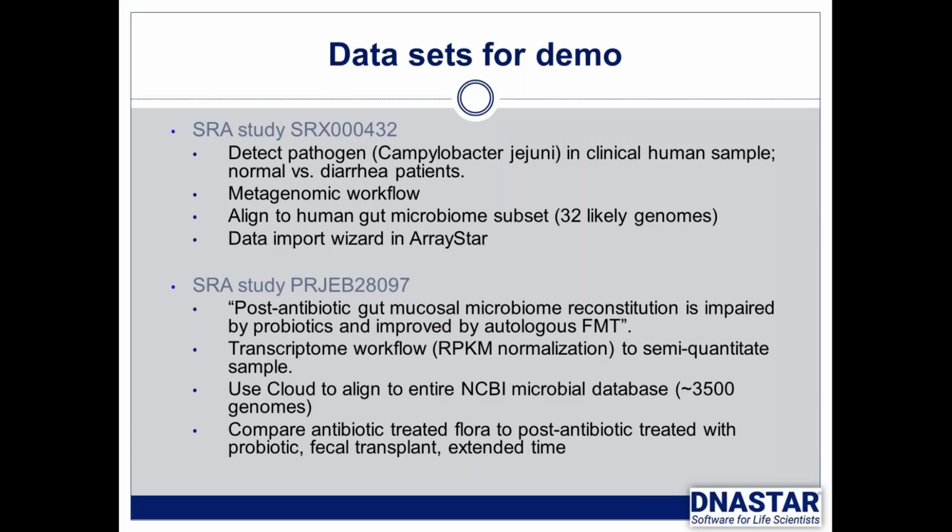And then we have a larger data set that is really a very large clinical study. And it was to look at what happens to the human gut after treatment with antibiotics. So you would see the normal gut, treat it with antibiotics, which would wipe out a lot of the normal flora, and then how to best restore that.